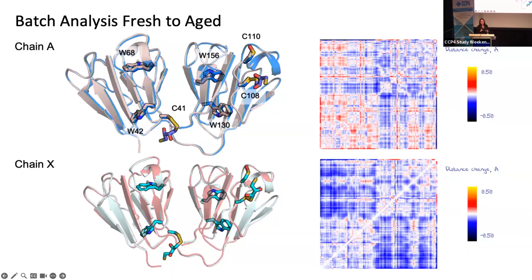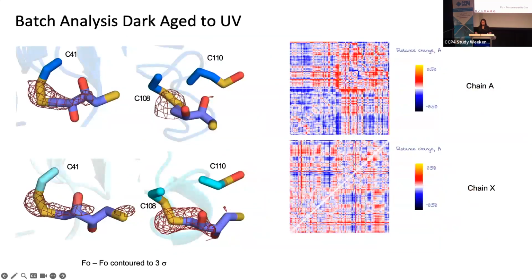We're not completely sure yet why there's a difference between the two chains, but obviously the answer always comes back to crystal contacts. And then we did the same again after exposure to UV, and we saw the inverse happening. So we're seeing a return here. We're seeing a return from the expanded to the contracted states, and that's important then for chaperone recognition in our protein.